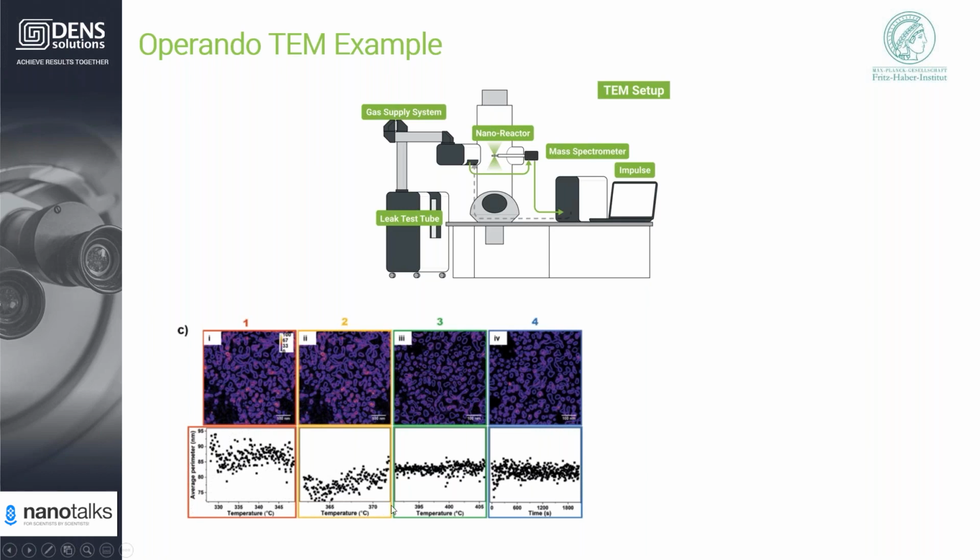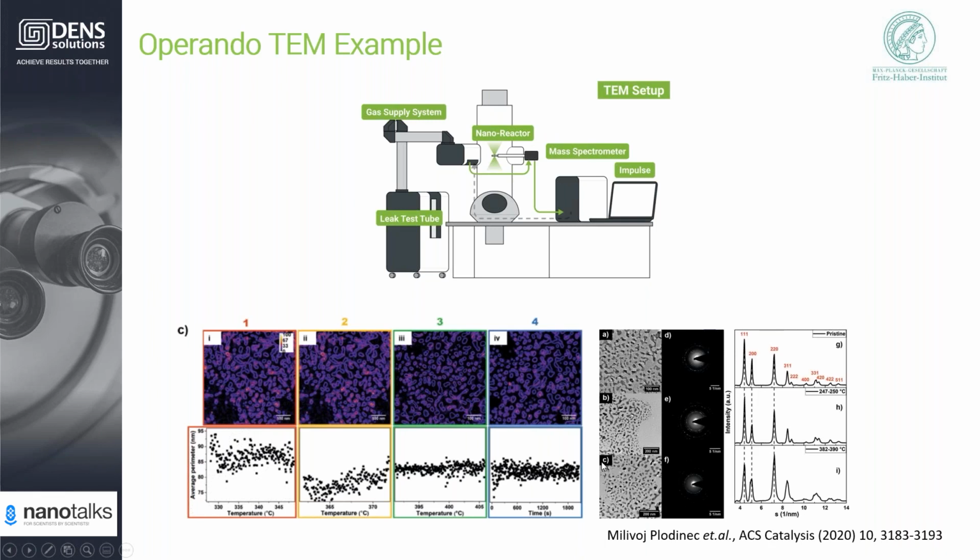After 380 degrees Celsius, the morphology doesn't change much anymore, at least not observably from the TEM images. Instead, people observed mainly a structural change, which relies on the lattice parameter change. And they also revealed this is not monotonic, like, I increase the temperature and the lattice expands. It's not like this. Actually, the lattice parameter increases, decreases, increases, which is a non-linear behavior.